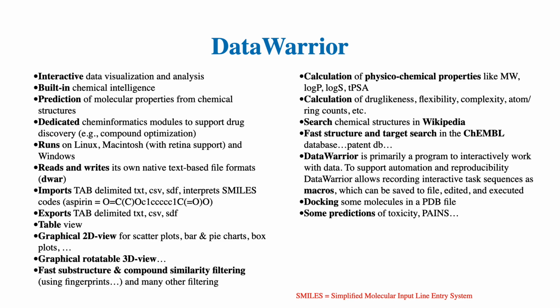Think of DataWarrior as a digital laboratory assistant that not only understands and organizes your chemical data, but also actively helps you analyze, visualize, and discover new insights.